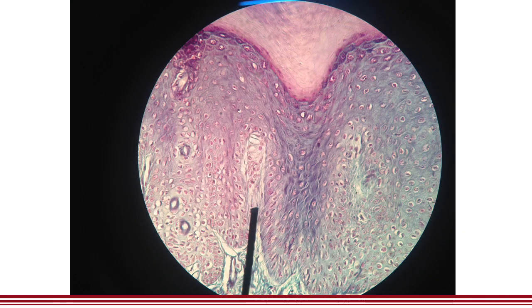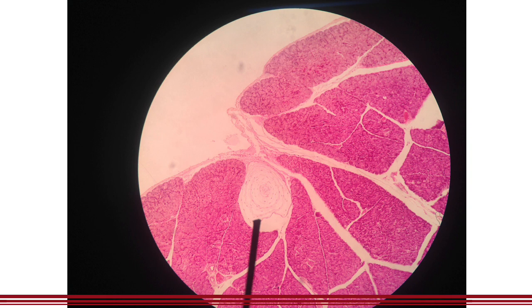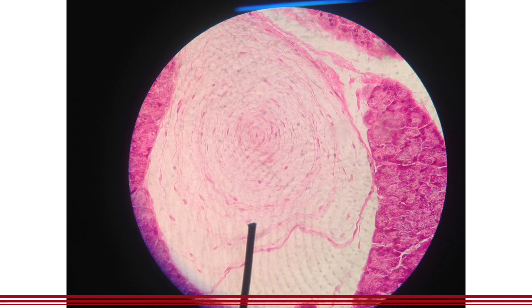So these are free nerve endings in the skin. These facilitate detection of pain. Okay? This one is a Pacinian corpuscle, okay? Onion-like. And they facilitate detection of deep pressure, or deep touch. Again, a Pacinian corpuscle. So these are examples of mechanoreceptors or sensory receptors in the skin and the deeper tissues.